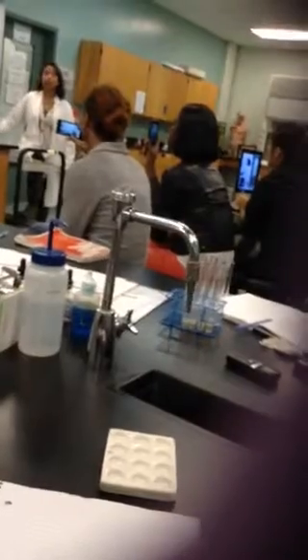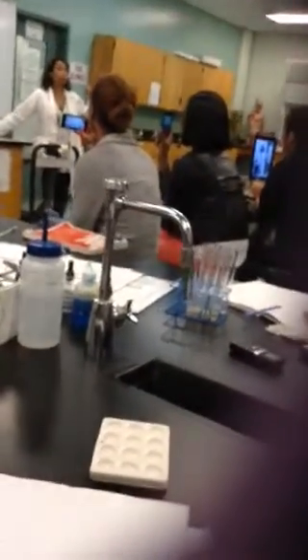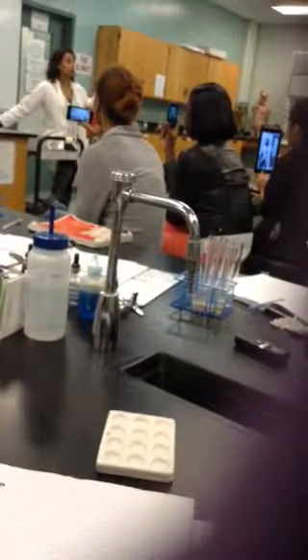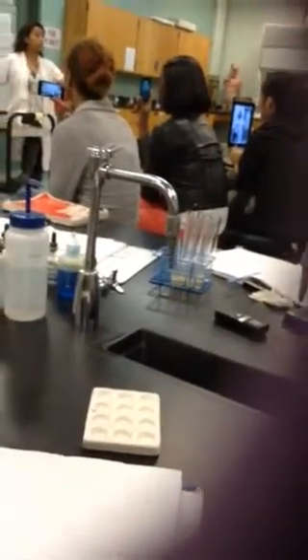Your starch should not be as dark. This dark color could also be because the amylase could be old, and amylase is an enzyme. Enzymes denature very easily. If you don't want an enzyme to denature, you have to keep it at really cold temperatures at all times. So it could also be that our amylase is really weak and it's not working to its full potential. But if it's at full potential, you should not be able to detect any starch. It should have been digested all the way.